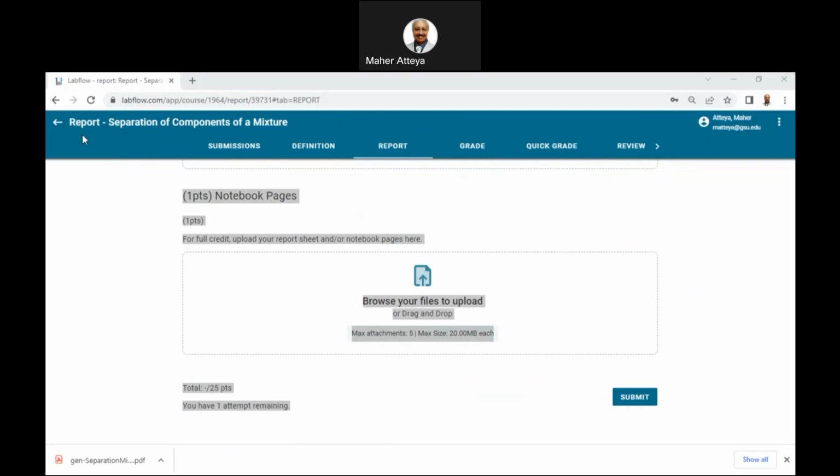Copy of this, copy, will be this here, paste. 0.101 divided by 0.812 multiplied by 100%. Equal to. So let's do this.